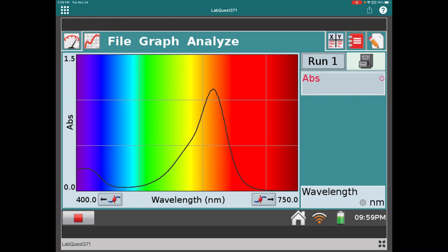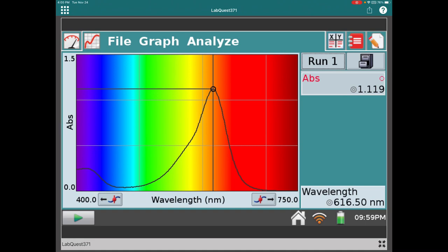There we go — pressing stop. You can now see the absorption spectrum for malachite green. Since it's a greenish blue-colored solution, absorbance values are very low in the blue-green region — it's transmitting those colors, which is why the solution looks blue-green. The wavelength of maximum absorbance is marked on screen: about 616.5 nanometers. We'll use 616 nanometers as our lambda max for both the Beer's Law experiments and the kinetics runs.